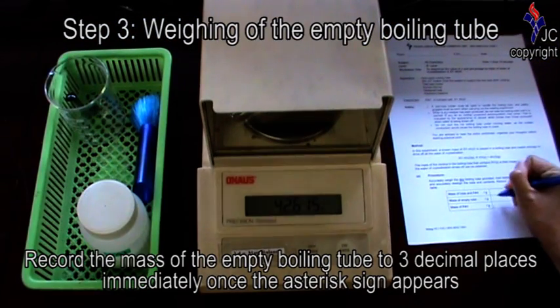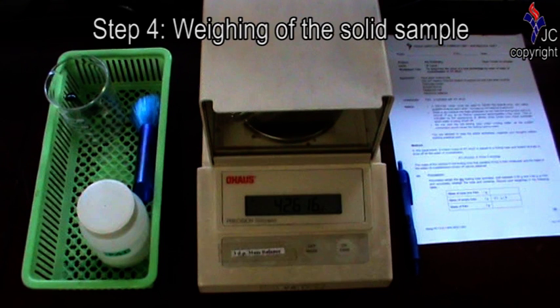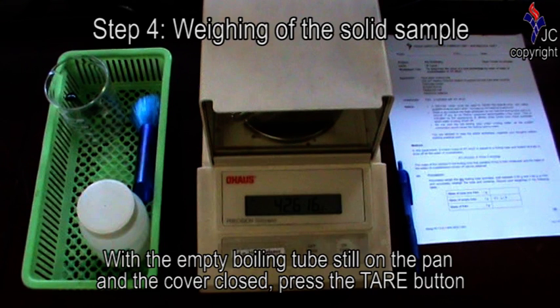Record the mass of the empty boiling tube to three decimal places immediately once the asterisk sign appears. With the empty boiling tube still on the pan and the cover closed, press the tare button.